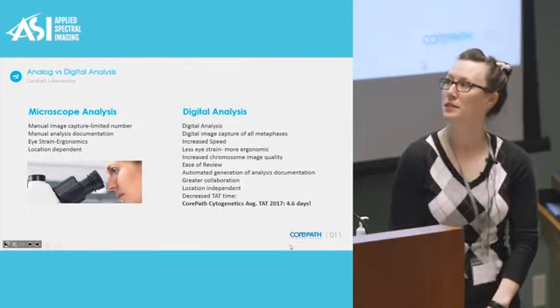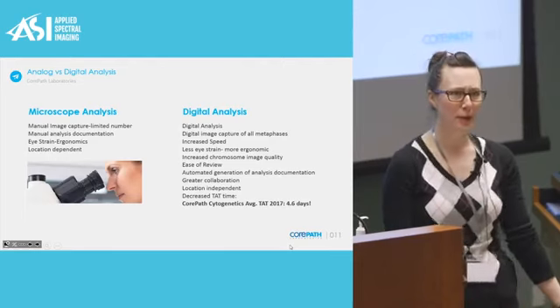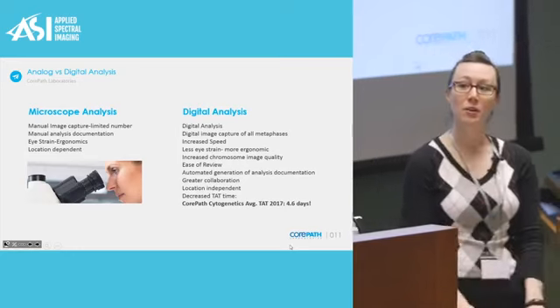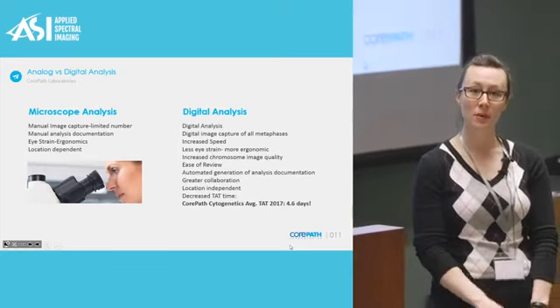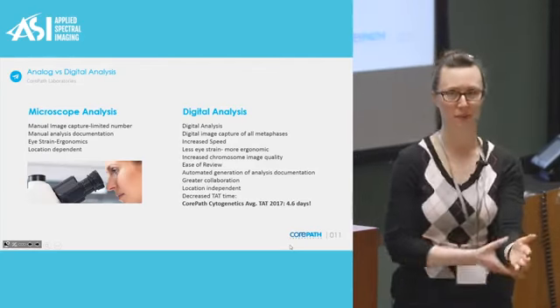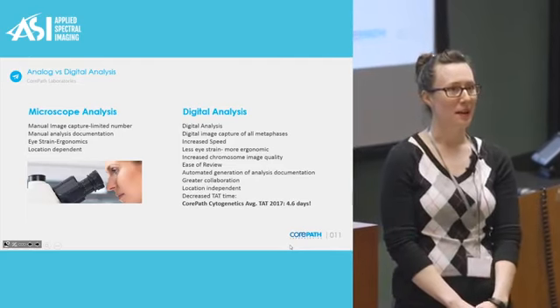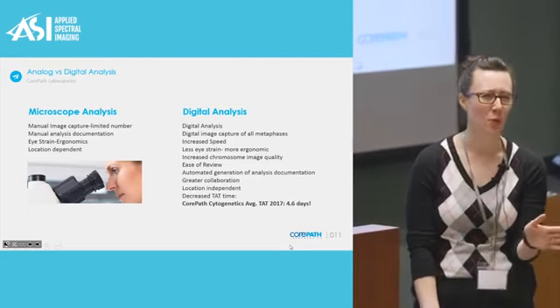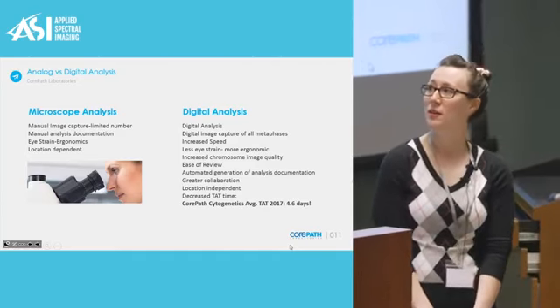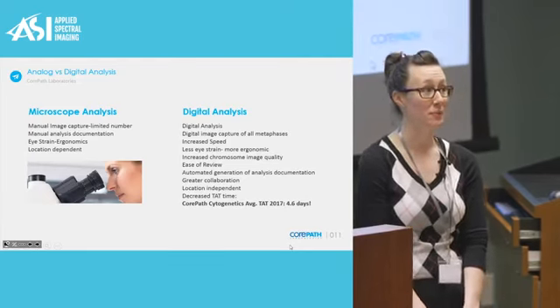I also wanted to touch base a little bit about old school and new school technology. That's kind of why we're here, right? To kind of see what changes are happening in this field. Now, you may or may not believe this, but when I went through the program and was doing my internships, I learned everything in the old school methodology. I know, right? Some of you are like, there's no way. Yes, way. I actually did my internships and learned everything, and there were not metaphase scanners widely available. We had to do everything manually.